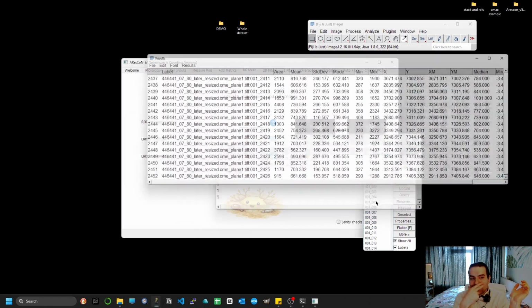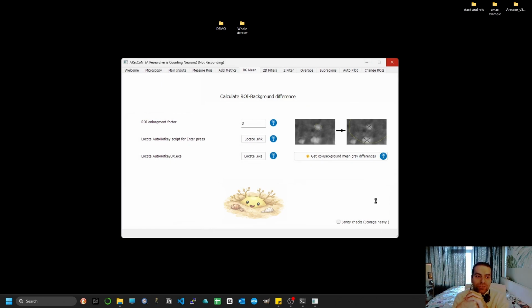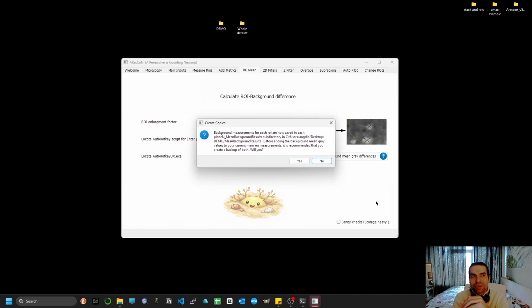The reason I'm getting this convex hull is that imagine you have some neurons lying at the edges of the hemisphere, at the very cortical part, and you're trying to filter them out based on their surrounding background mean. Even if the intensity of the cell itself or the nucleus itself is very low, the background coming from the real background, which is just the black part of the image outside your tissue, will artificially make your signal look quite intense, although it isn't.